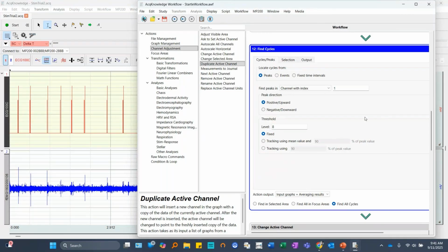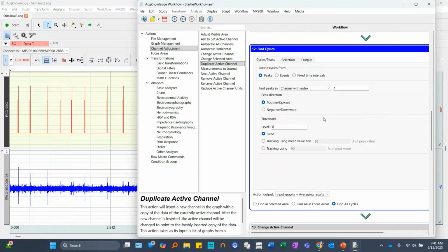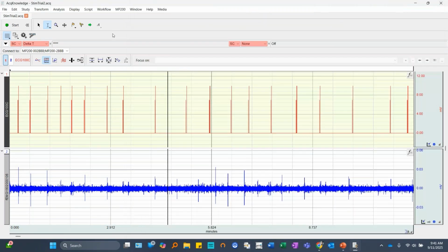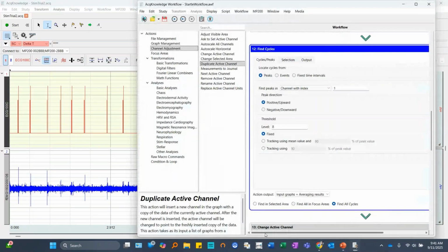So what we're going to do here, and do know that when you're building this out, this is not something that's going to come together in 30 seconds. I spent quite a bit of time on this, getting things dialed in. And one of the ways to do that is I do jump back and forth between the workflow and actually doing it under these menus, because certain things don't show up when you're doing it in workflow, for example. And I'll show you what I mean by that.